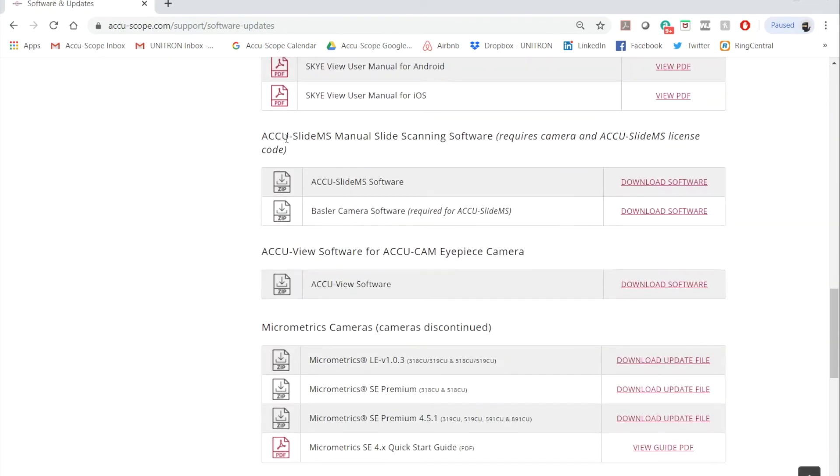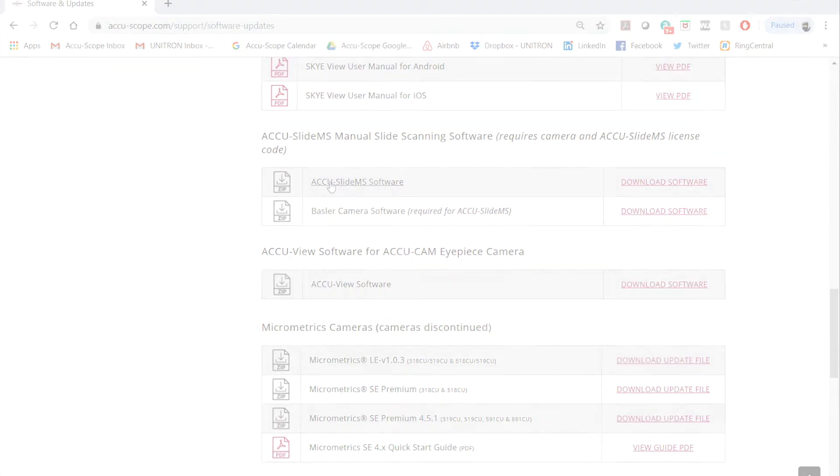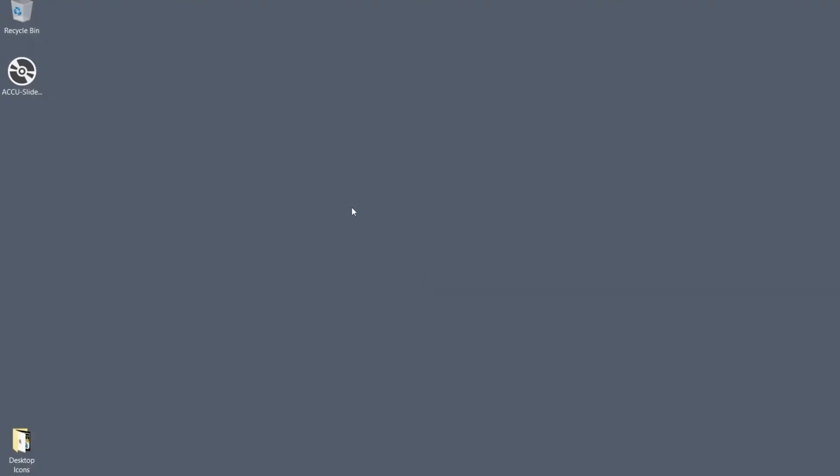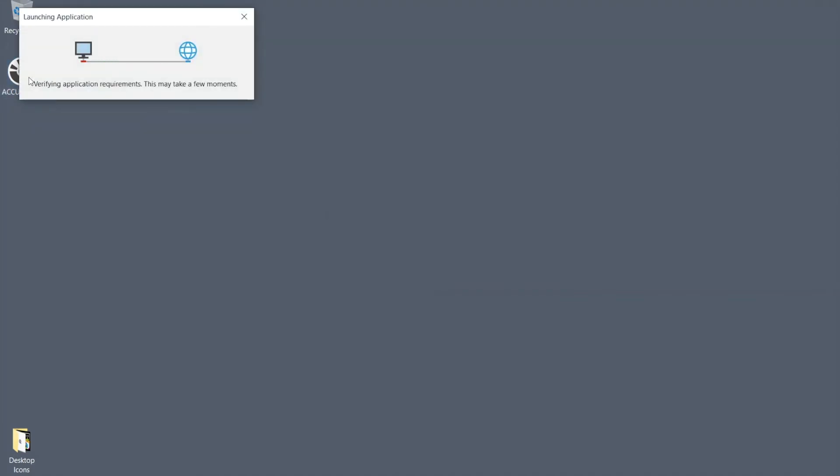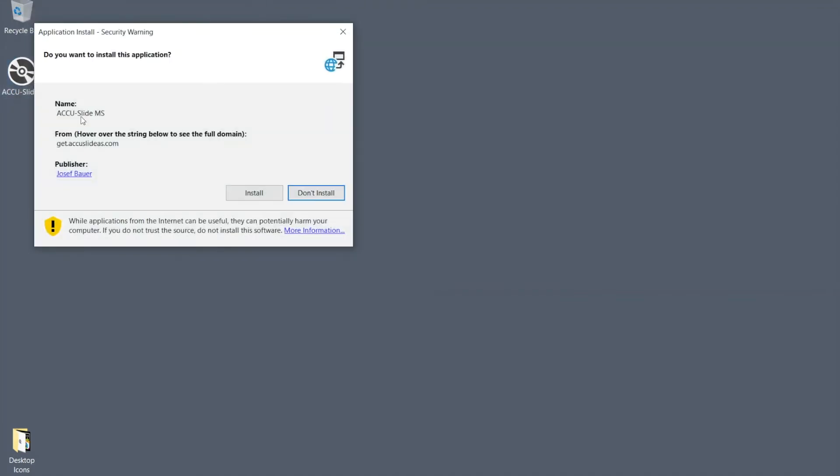After the download is complete, double-click the setup file to install the AccuSlide MS software. In this example, the setup file was downloaded to the desktop.